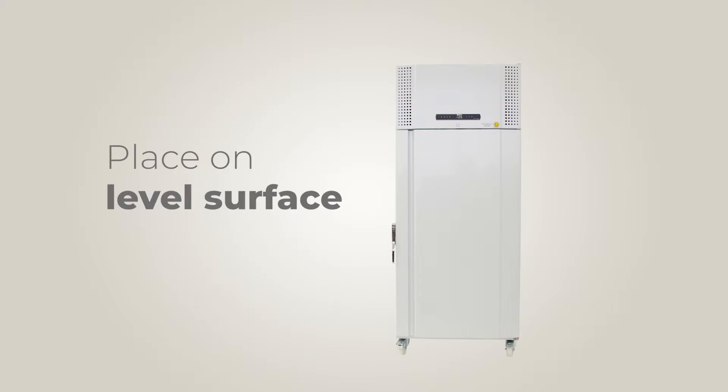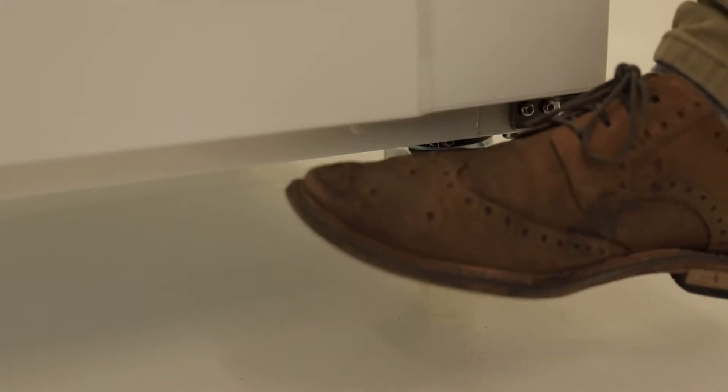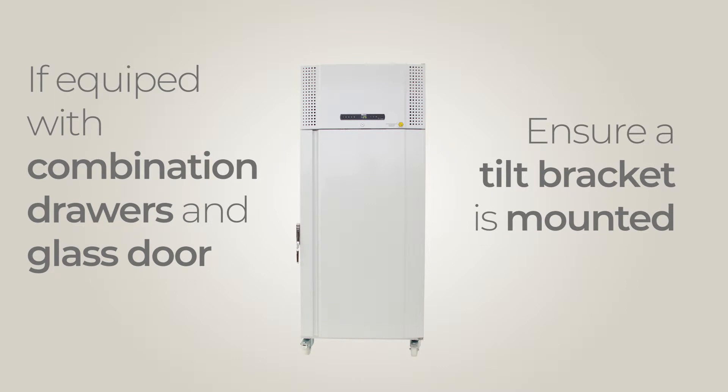Your cabinet must be placed on a sufficiently leveled surface, and if the cabinet is equipped with wheels or casters, make sure that they are locked once in position. If your cabinet is equipped with a combination of drawers and a glass door, ensure that a tilt bracket is mounted.